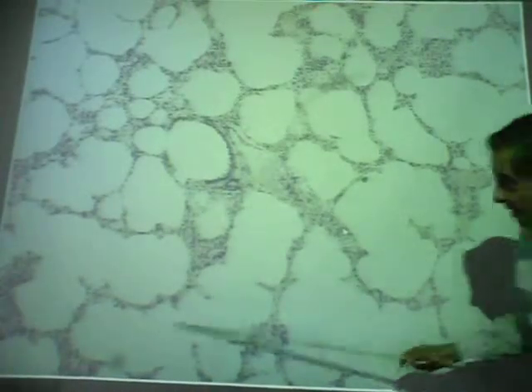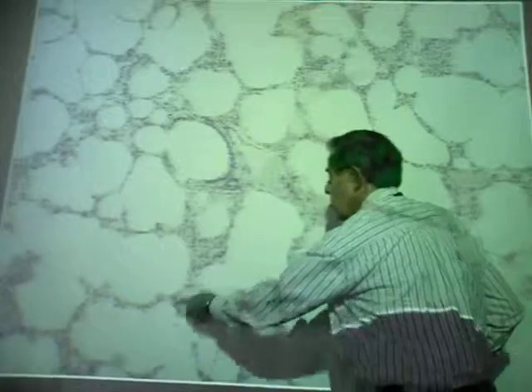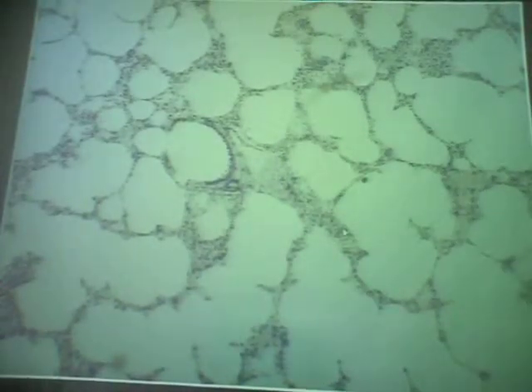These would be alveolar ducts, like we see here. They're all alveoli in the wall, so all simple squamous. There's another alveolar duct there. Okay. If you look around, there's the bronchiole again.